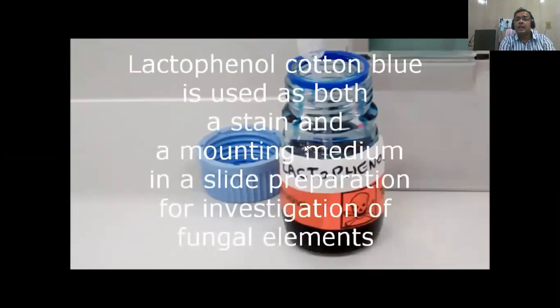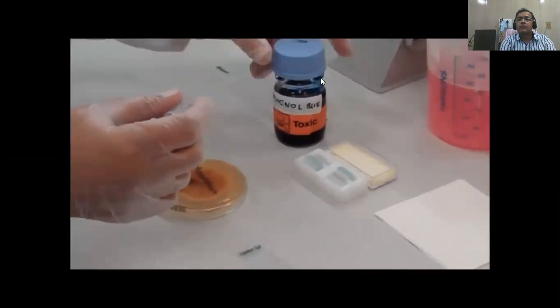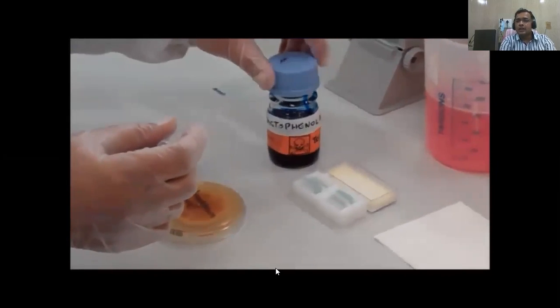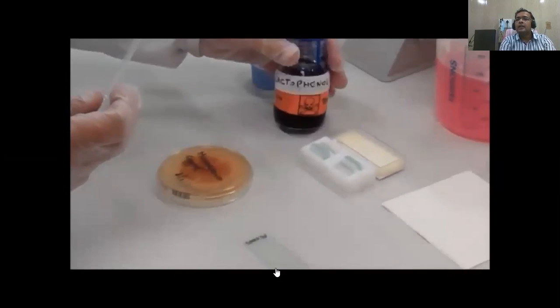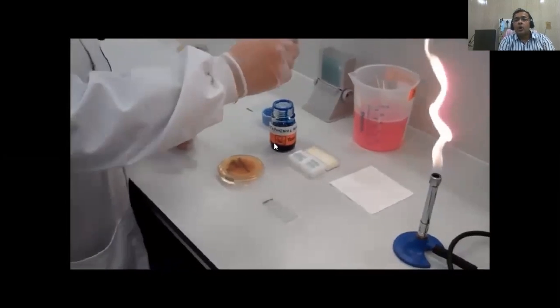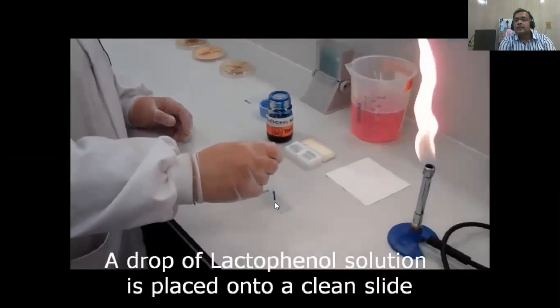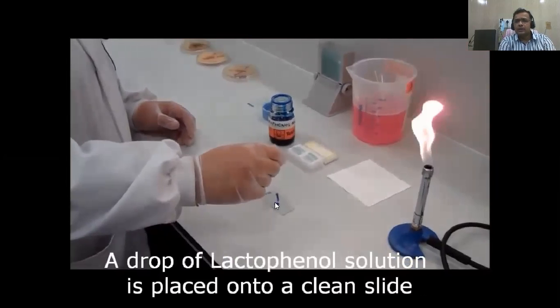So this stain we generally use as a mounting stain. First we require the stain, our culture, cover slip and slide, that you have to prepare and keep ready. Then you have to take one small drop of lactophenol blue with a dropper over the clean glass slide. This is sufficient to stain a loopful of fungus culture.